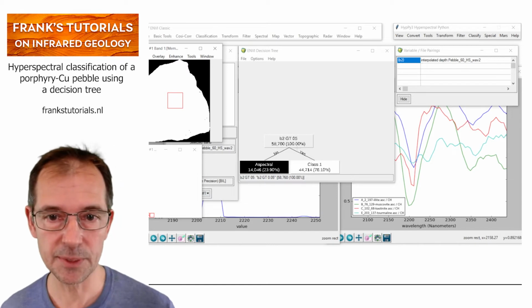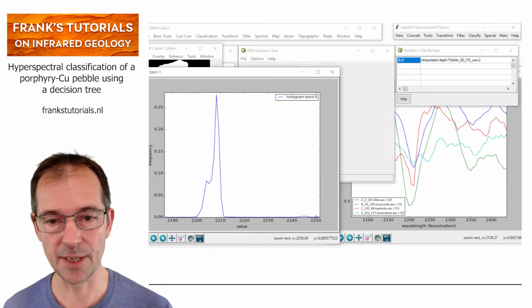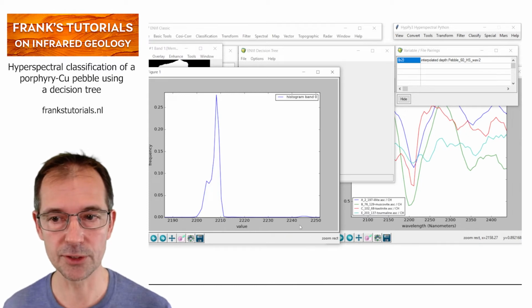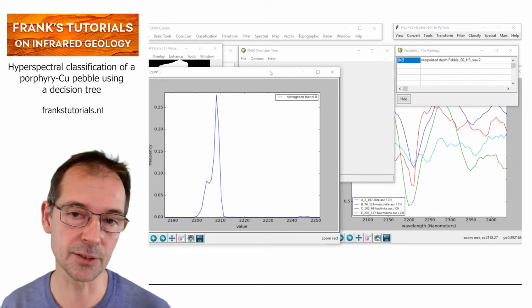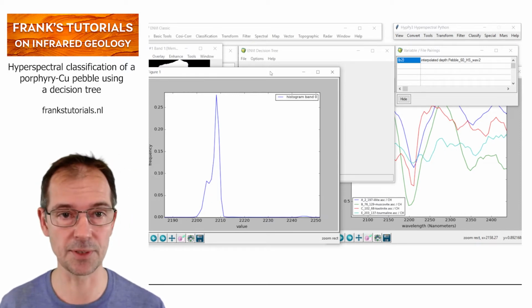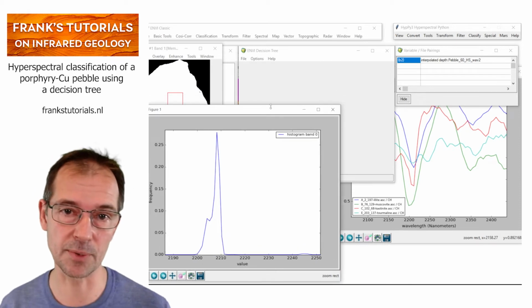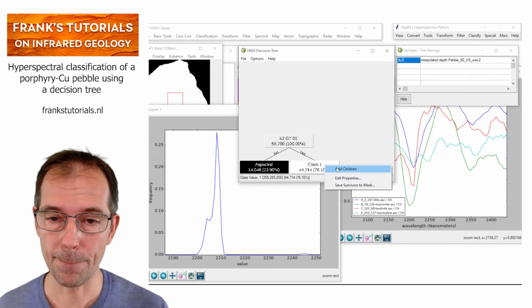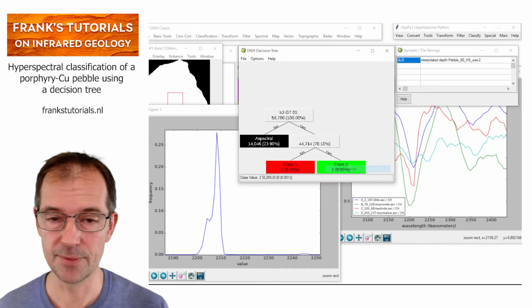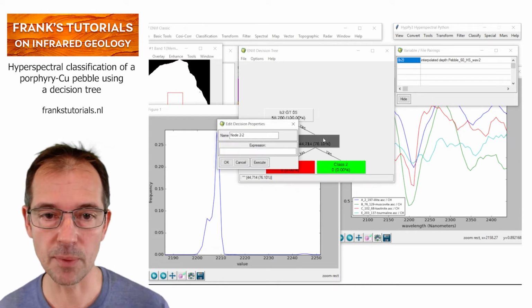And then we said, all right, now we want to identify this group of pixels, because they are probably because of tourmaline, because it's the only mineral that can have a deepest absorption feature in that range of the 4 minerals that we're considering here, of course. So let's add children. Yeah, so we add another decision node.